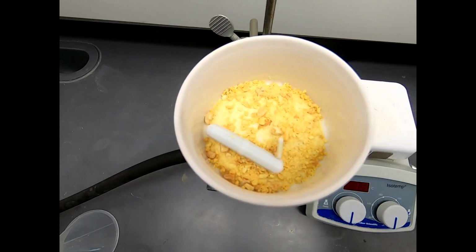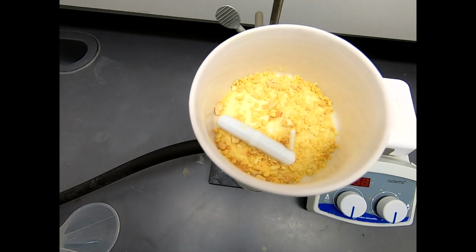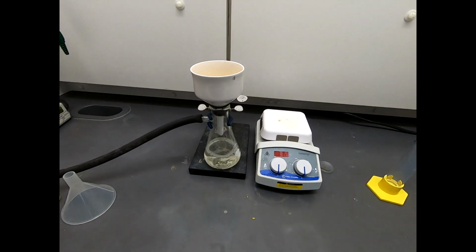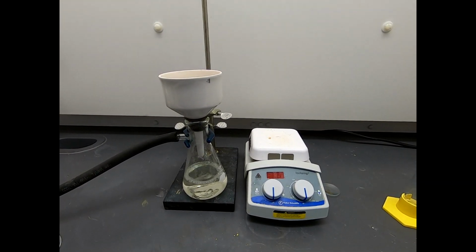There it is. You can see there are some pieces in there. It's not all fine powder, but that's not terrible. That's not bad. I'm fairly content with that. So I'm just going to let this air dry now. I'll probably spread this out, put it on a watch glass, and get it nice and dry, and then get it weighed out, and I'll come back and show you what we got.